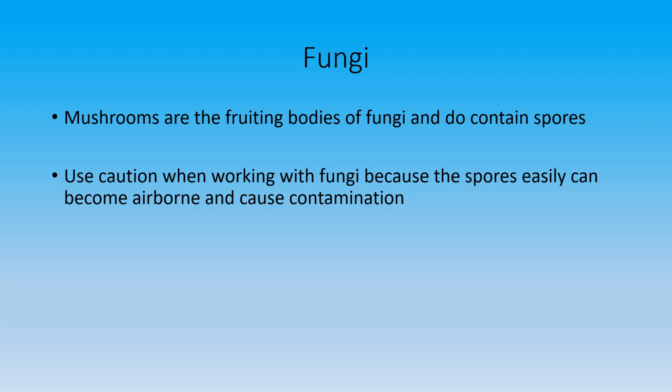Whether you're working with the mushroom fruiting body, which is often hard to grow in the lab, or even just a regular petri dish growing fungi, one thing to be aware of is that fungi do produce spores. And so when you open a petri dish, anytime you're working with them, you want to be aware of those spores and not allow them to become airborne and therefore possibly contaminate other things in the lab. So you just have to take some extra precautions with it.